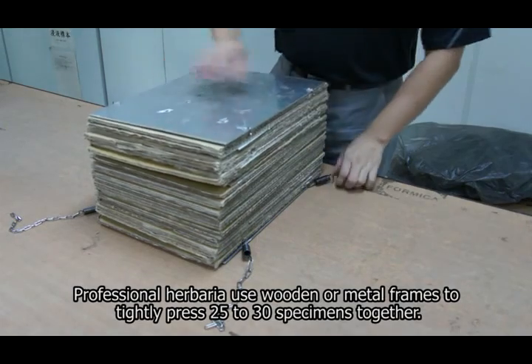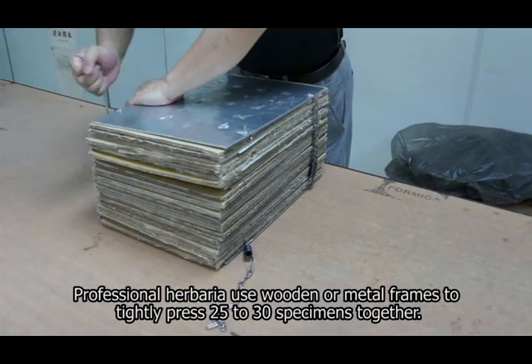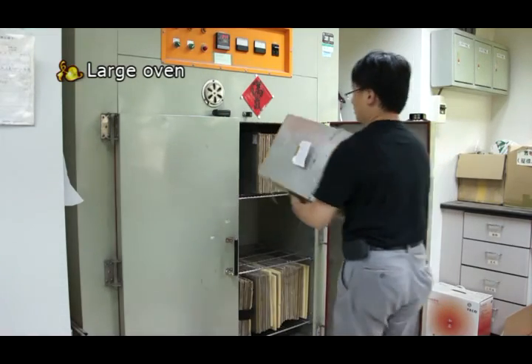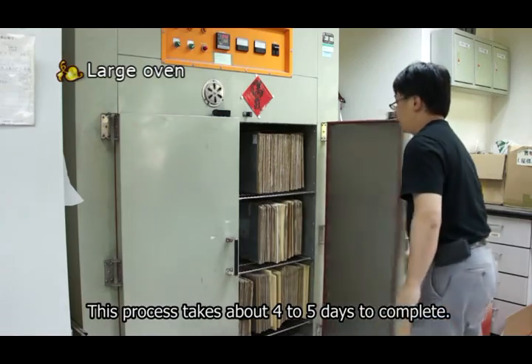Professional herbaria use wooden or metal frames to tightly press 25 to 30 specimens together. Afterwards, the specimens are dried in a large dryer at 40 degrees Celsius. This process takes about 4 to 5 days to complete.